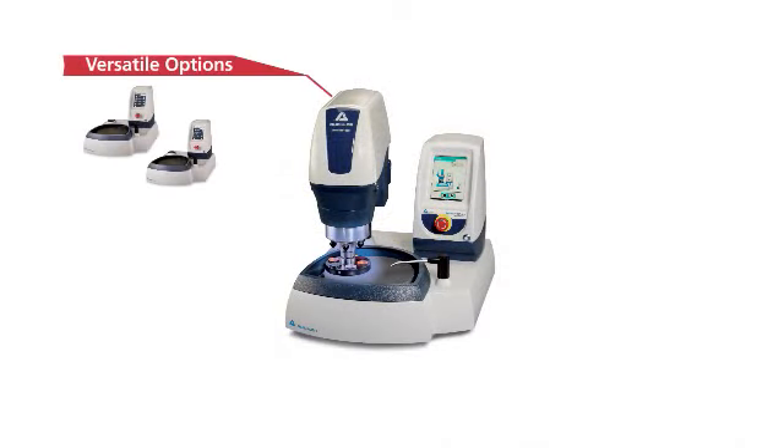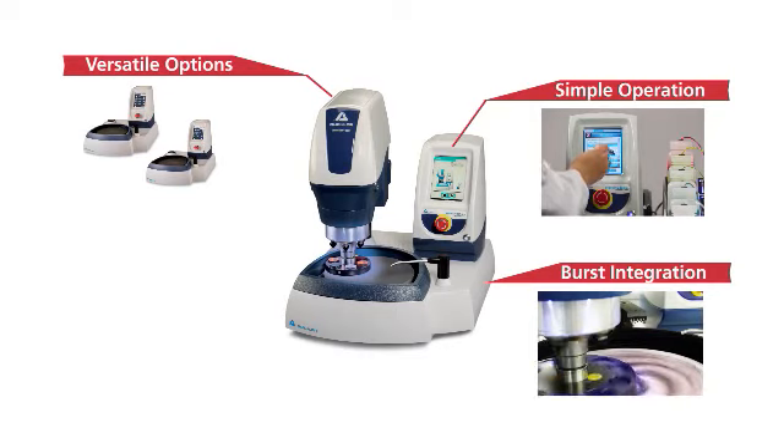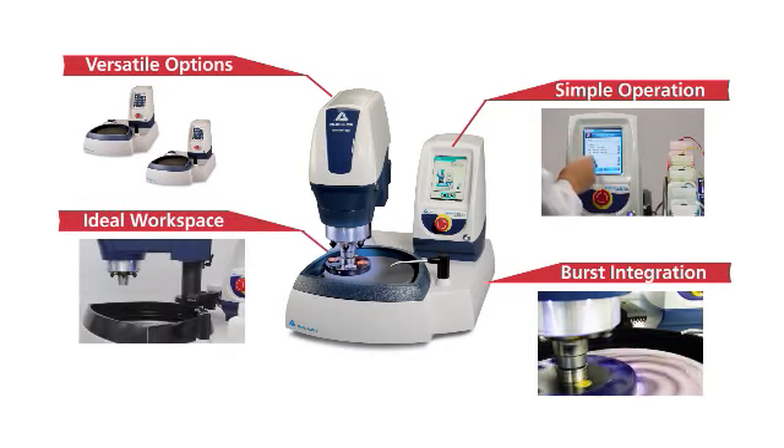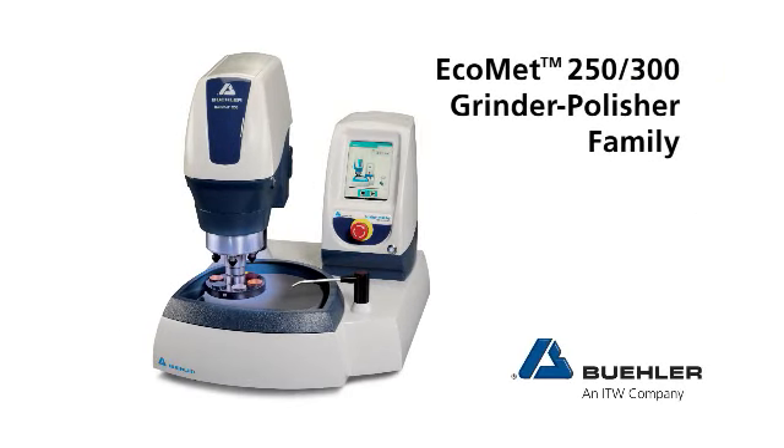Versatile options, simple operation, seamless burst integration, ideal workspace — well-lit and easy to clean. The EcoMet 250-300 grinder polisher family.